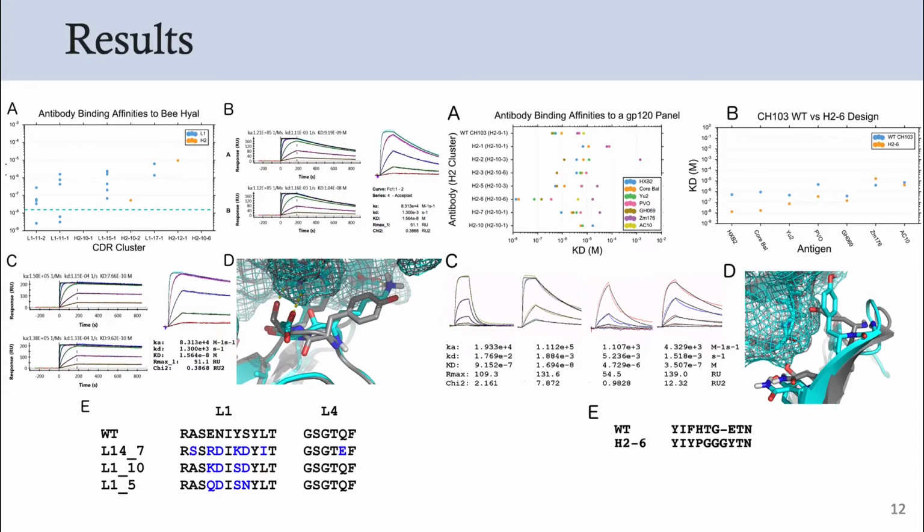Now you're probably wondering, does the algorithm work? In the initial RAbD paper, the authors sought to answer that question by experimentally validating their results by improving the affinity in two known antibody-antigen complexes. One antibody binds to the main allergen in bee venom, and the other binds to HIV gp120. Both have published crystal structures.